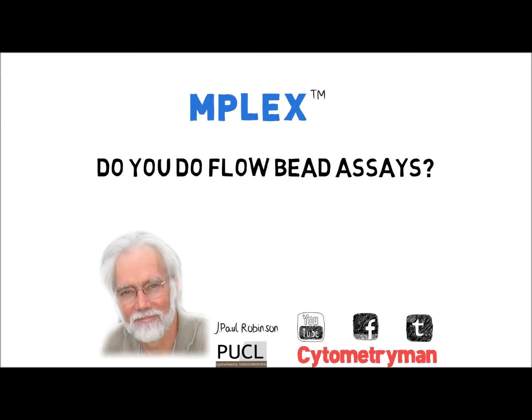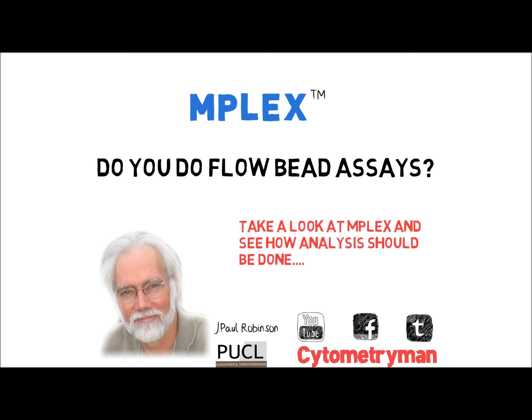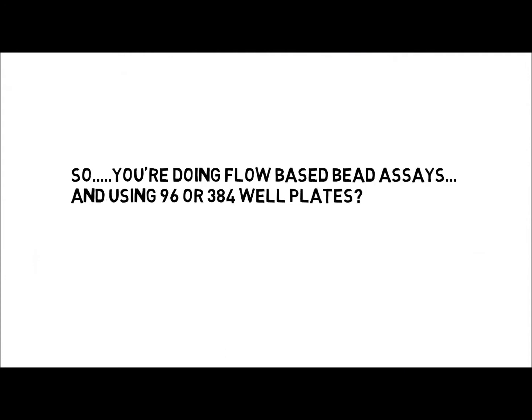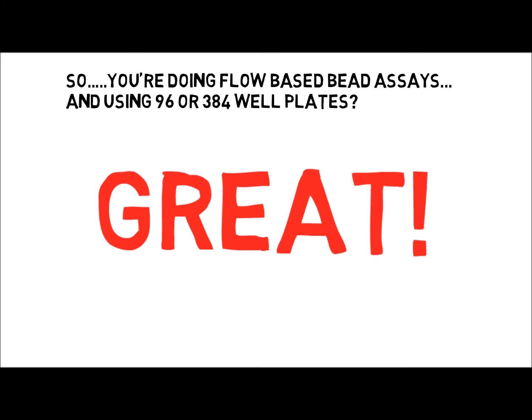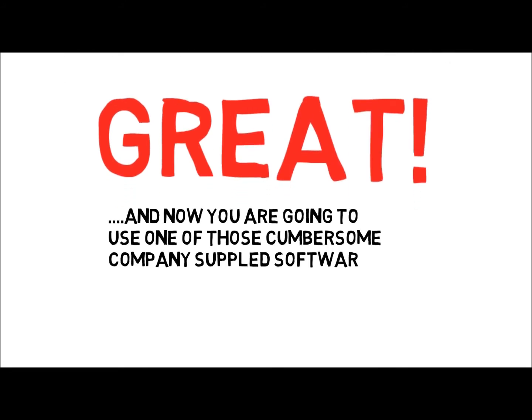Do you do flow bead assays? Take a look at MPLEX and see how data analysis should be done. So you're doing flow-based bead assays and using 96 or 384 well plates. Great. And now you're going to use one of those cumbersome company-supplied software programs to analyze the data.